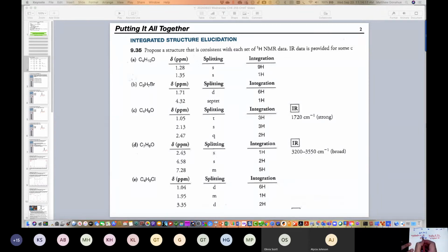It's also at position 2. It's a single carbon, and 1 carbon is a methyl, derived from methane, where we changed the name to methyl. So this is now 2-methyl-2-propanol. That would be the name of that compound.